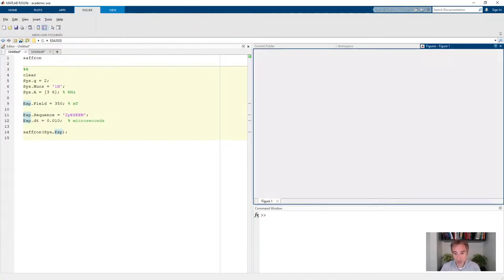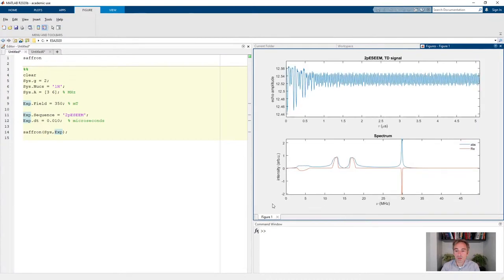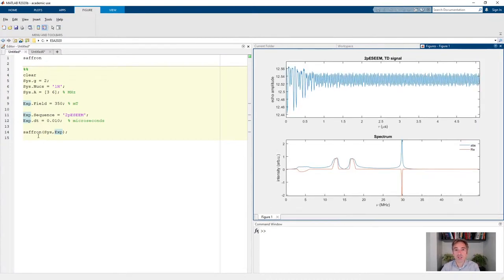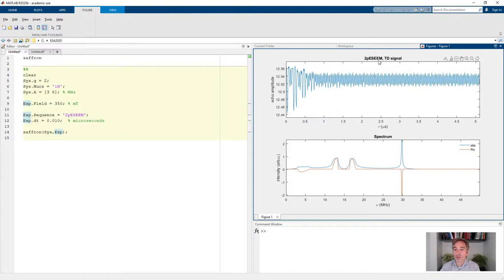Running this section gives us a plot. Like many EasySpin functions, if you don't ask for any output it will generate a plot of the results so you can quickly check whether it's working. On the top you see the simulated time domain signal for the two-pulse ESEEM — the tau value is on the x-axis and the echo amplitude is on the vertical axis.